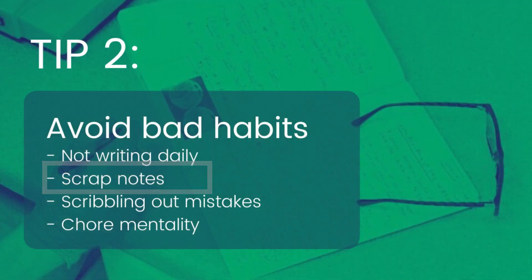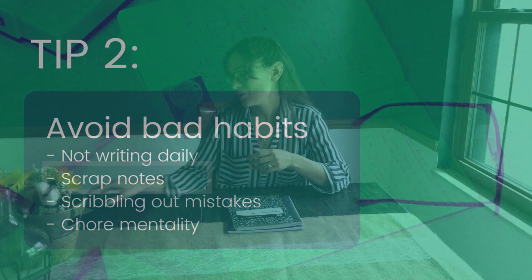The next bad habit is using post-it notes, scrap paper, or paper towels for your in-the-moment notes. The reason this is bad is because anything you're writing on something like this just isn't going to be detailed enough for your lab notebook. Plus, you run the chance of losing it or it getting damaged from spills and things like that.